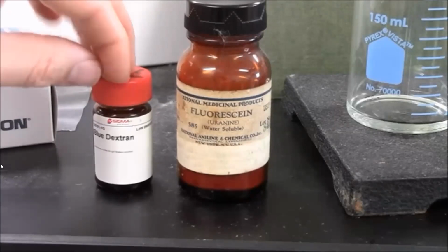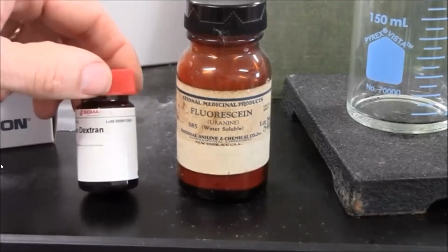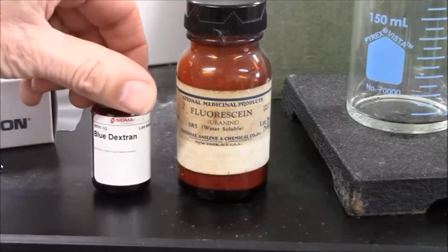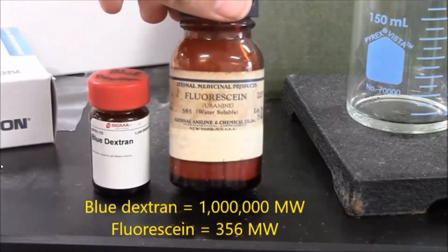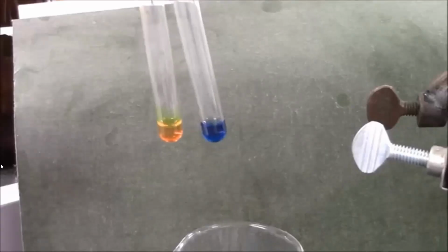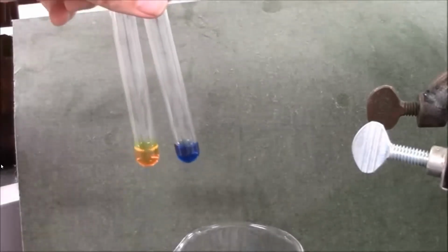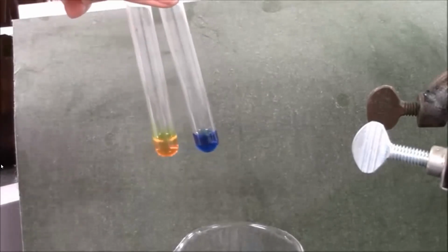I'm going to put a mixture of 2 molecules onto the column. Blue dextran is a very large molecule. It's a polysaccharide. Molecular weight about 1 million. Fluorescein, on the other hand, is a small molecule. Molecular weight about 350 grams per mole. I chose these 2 molecules because they're nicely colored, so I'll be easily able to see the separation visually as they go through the gel filtration.